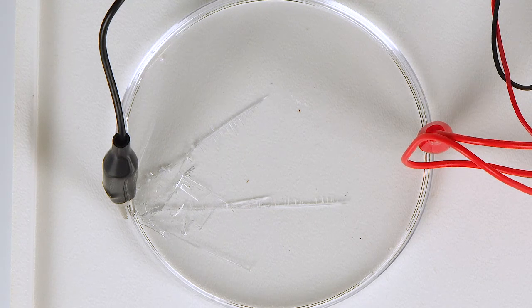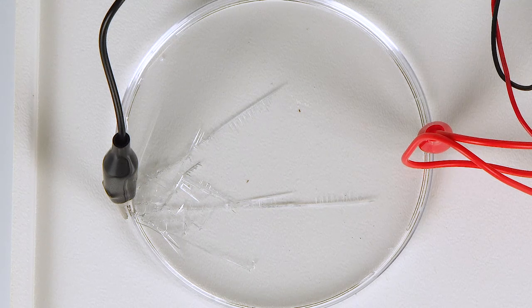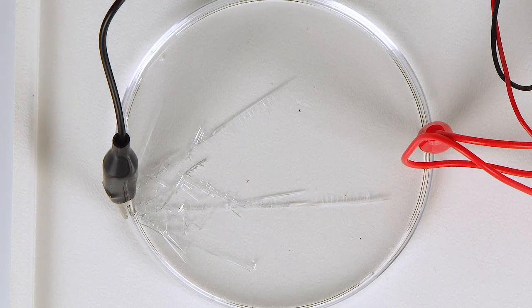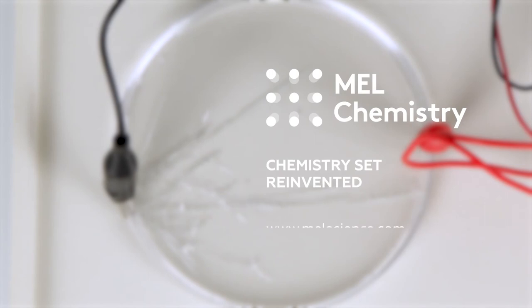The excess of electrons from the black wire go to the tin ions in the solution, reducing them to metallic tin, which grows in the petri dish in the form of beautiful dendrites. Learn more about this experiment on our MELScience website.